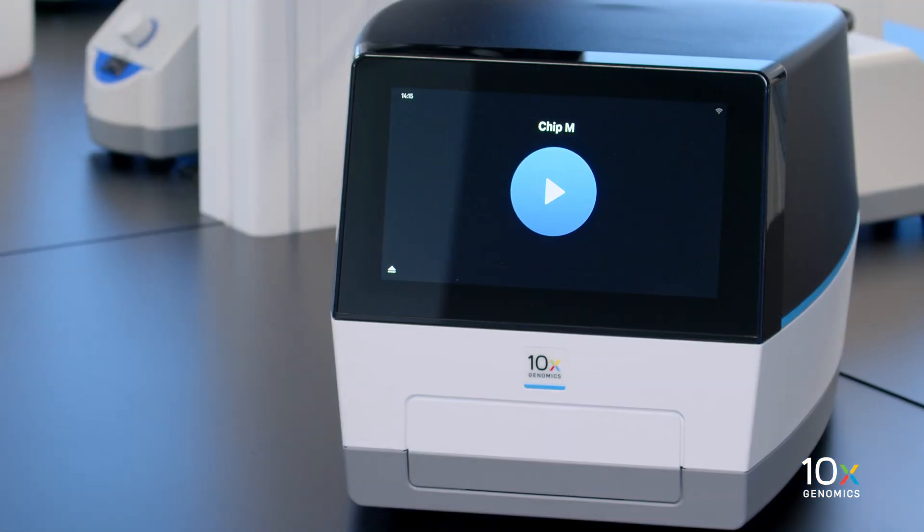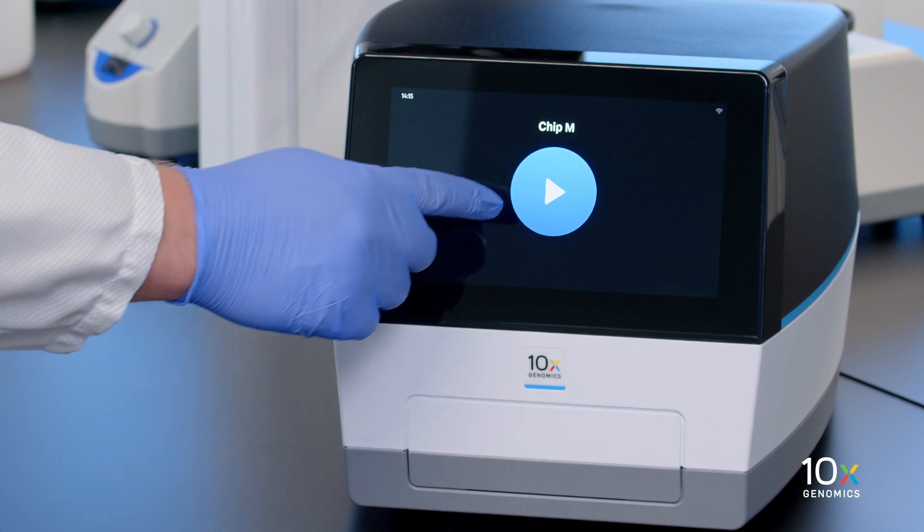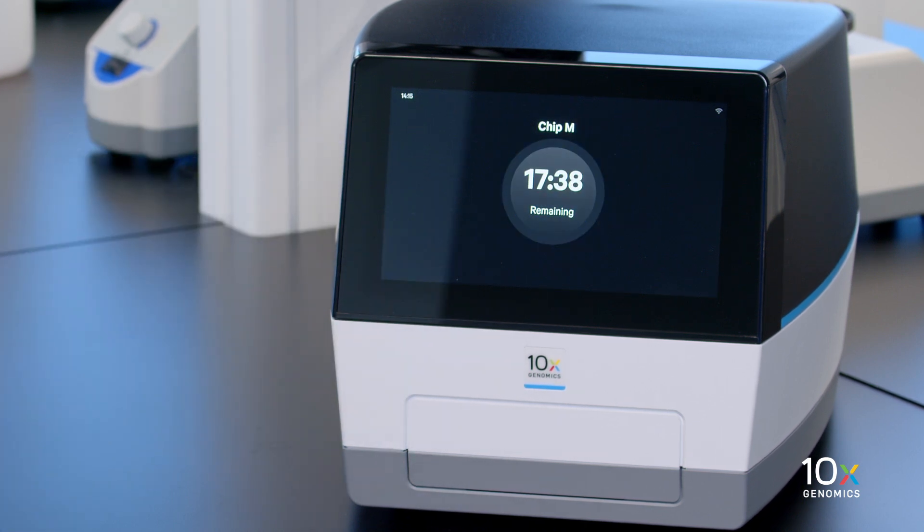We confirm that the Chromium instrument identifies the correct chip configuration. Then we initiate the run by pressing the play button. The run will take about 18 minutes.